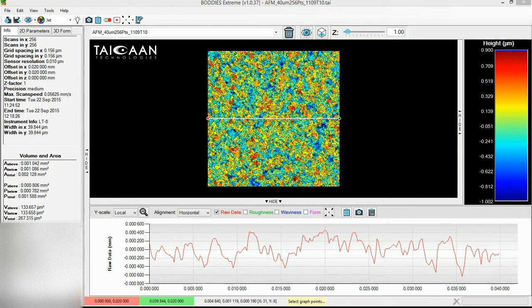In this presentation, I'm going to offer an introduction to some two-dimensional roughness parameters. In the image space here, you can see we have the AFM data as highlighted in the previous presentation, with the cross-section shown corresponding to the midsection horizontal line shown in the image space.